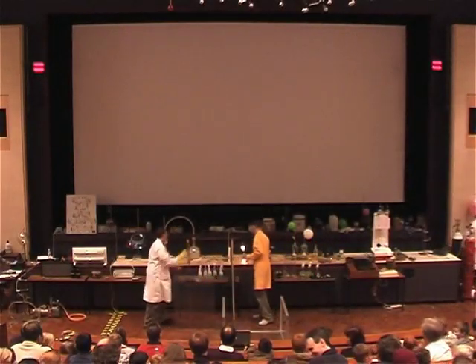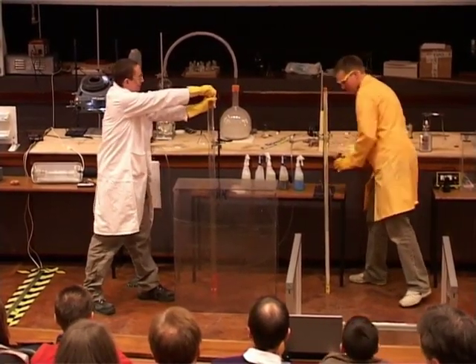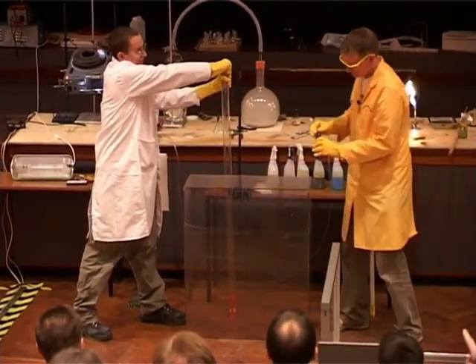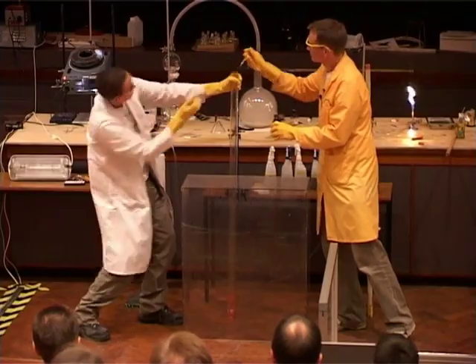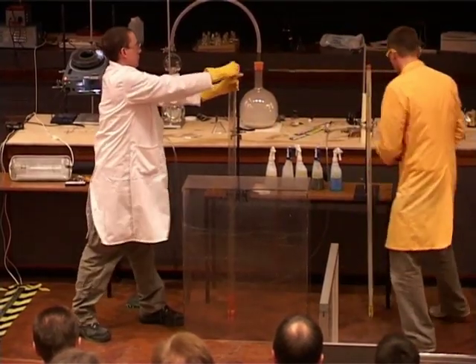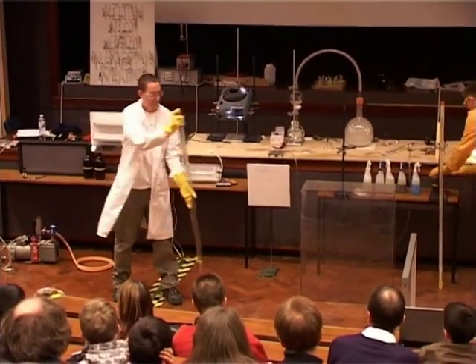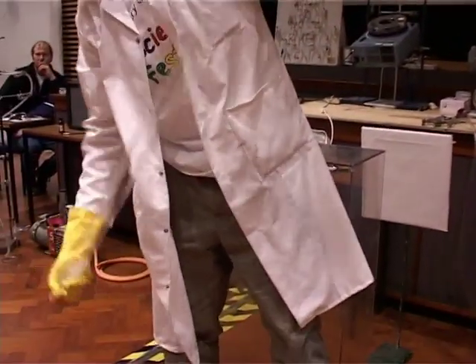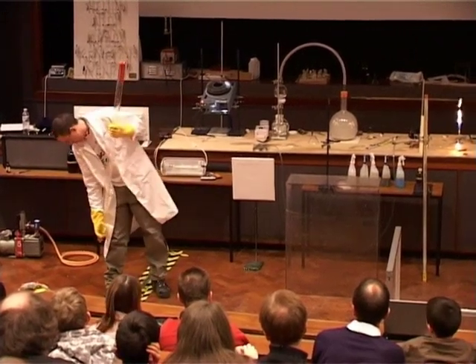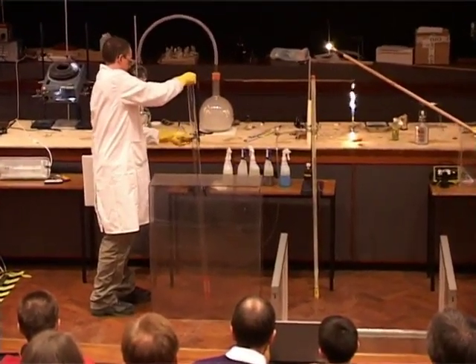Just in case you missed that one, we'll try a slightly bigger one. So we're mixing the two together, the nitric oxide, NO, and the carbon disulfide.